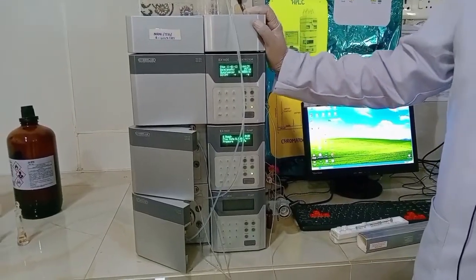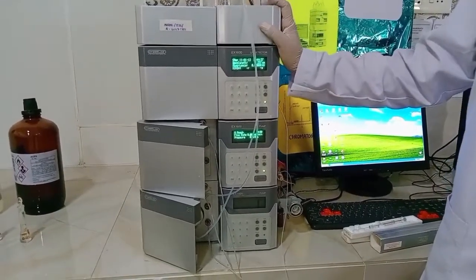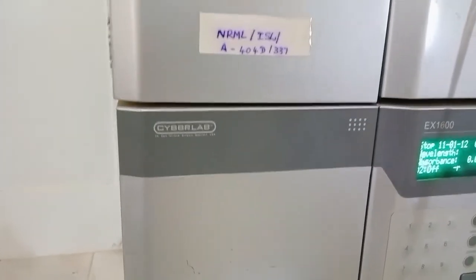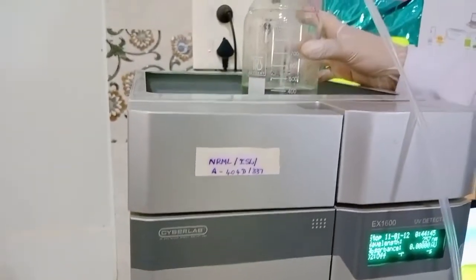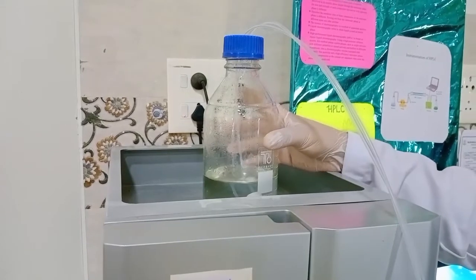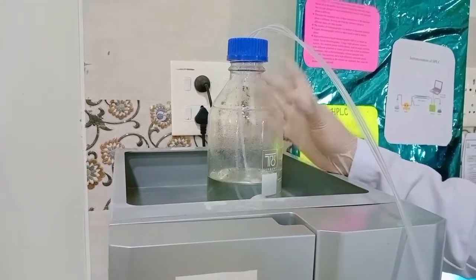This is the HPLC equipment we have in our laboratory. Cyber Labs is the manufacturer of this HPLC equipment. Coming to the components of the HPLC, the first one is the mobile phase reservoir. In the mobile phase reservoir, we are using HPLC grade solvents.